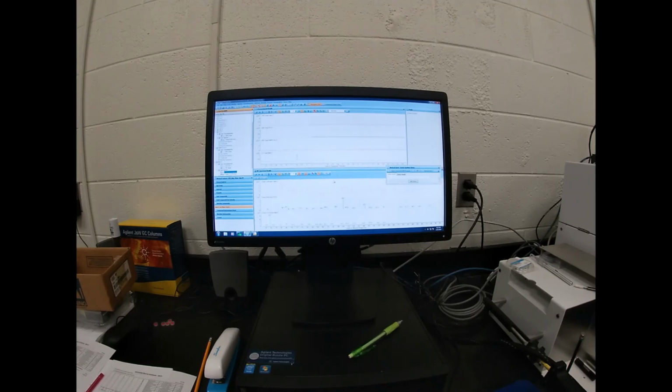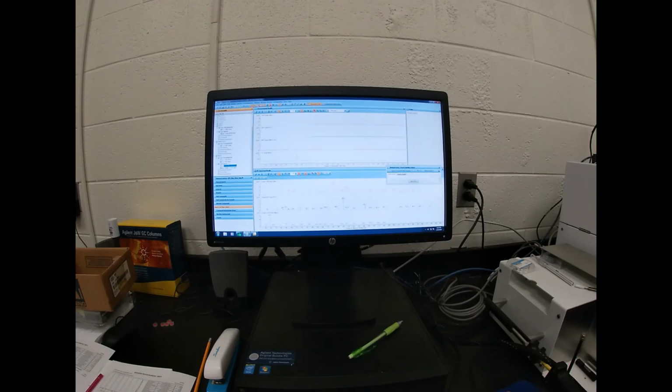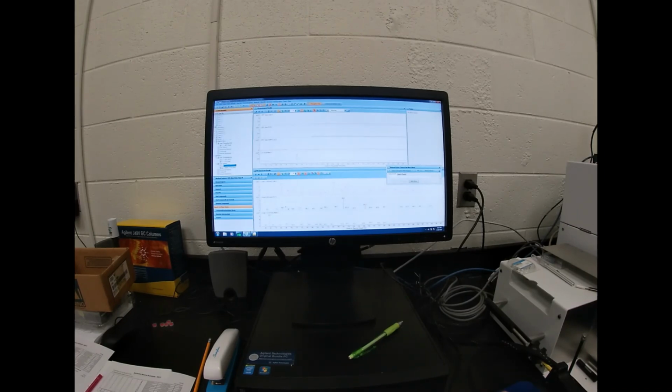All right. So we identified our meth, our PCP, and our cocaine from our original samples that have been collected from the punch bowl. Unfortunately, we also identified aspirin in the tablet unknown that we ran, our major unknown. So I will make sure these get posted for you guys.